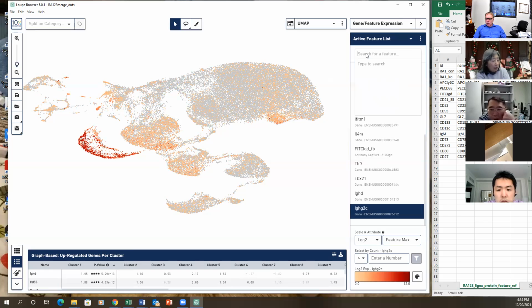What is that little population down there? This one? Yeah, that's the DN2. It has the DN2 signature, but it's not germinal center. Yeah, it's in the marginal area, I guess. Right, that's right. Icarus, yeah, what's the name? It's not Icarus. IKZF1, yes, it's this one.